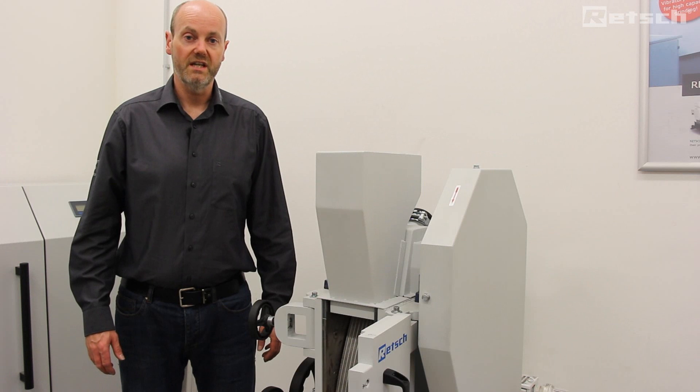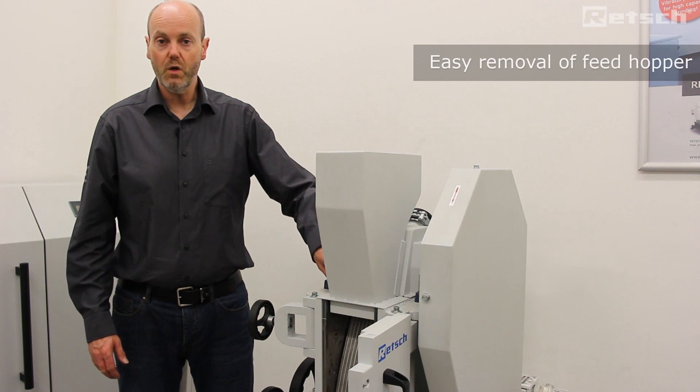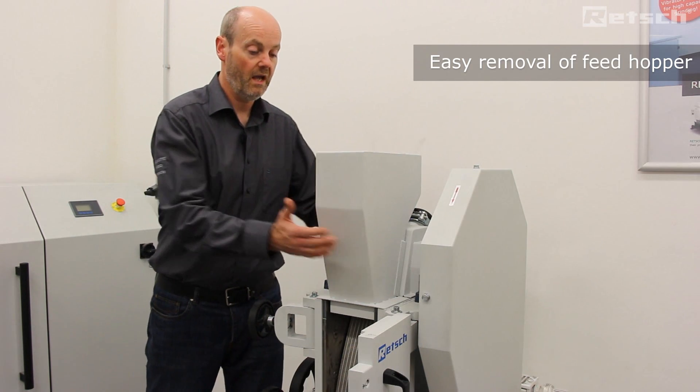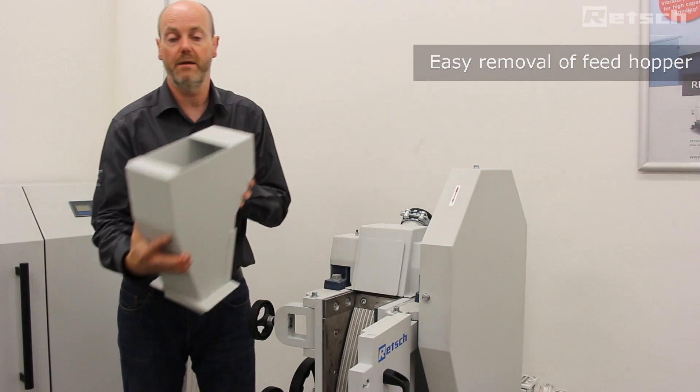This instrument is designed with convenience in mind. Therefore, with the use of a standard single allen key, we can remove the allen screw and simply lift and remove the feed hopper for cleaning purposes.